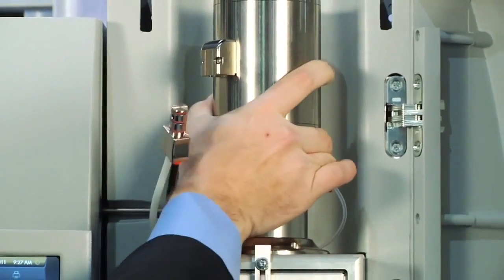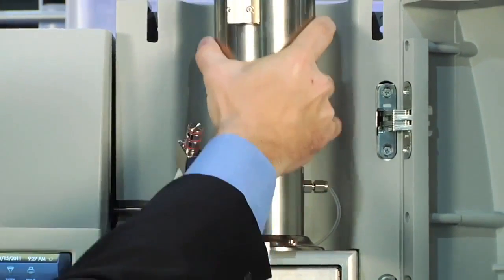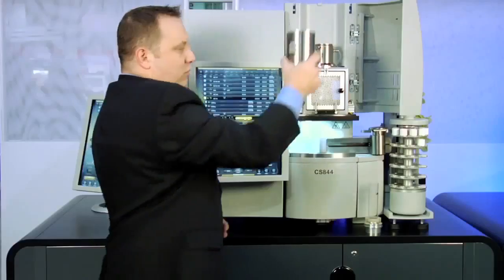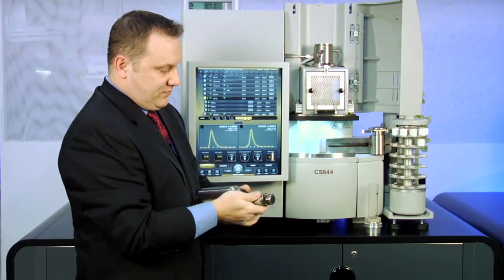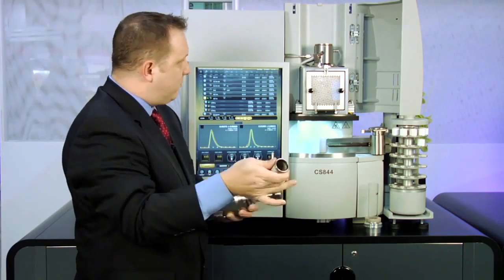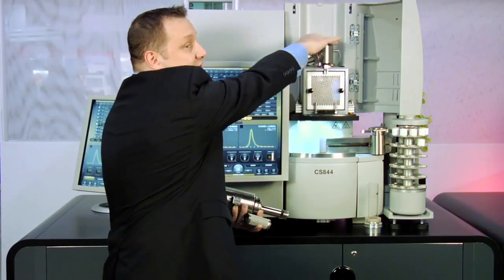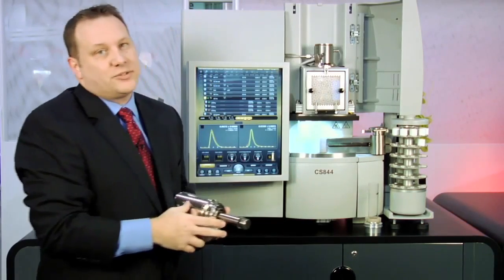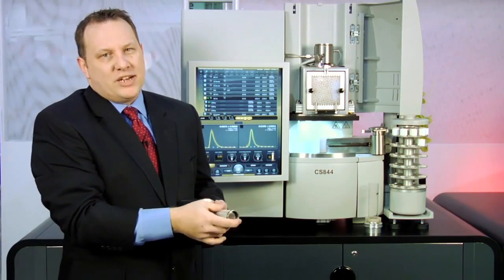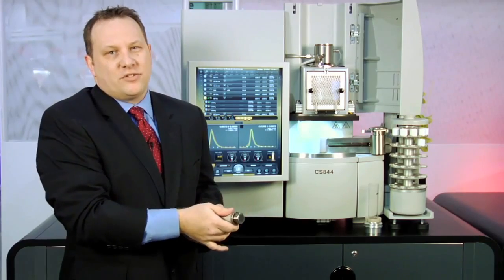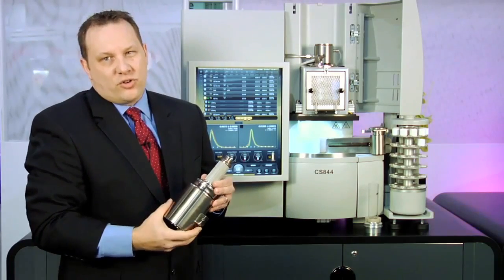There is a heated dust filter on the top of the furnace. This heated dust filter minimizes the amount of moisture that collects in the furnace and improves our sulfur recovery.